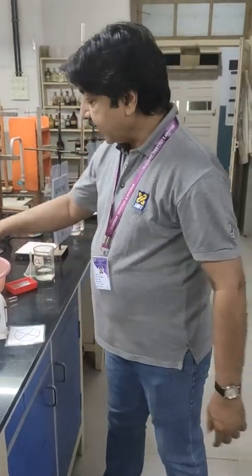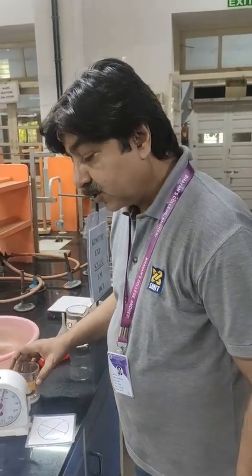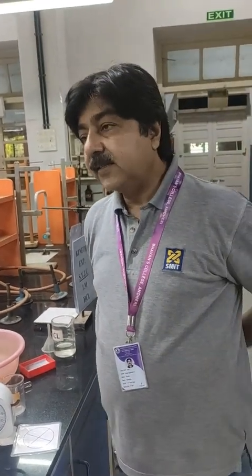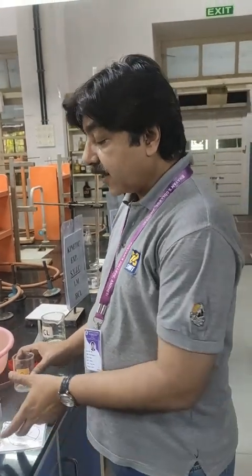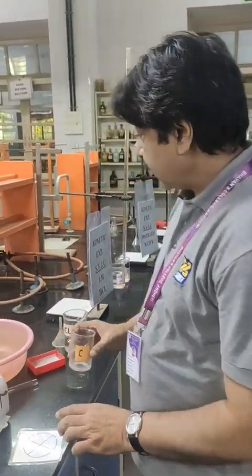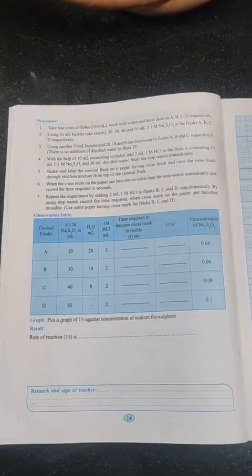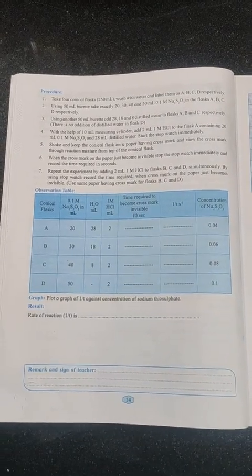Now in the same fashion we will proceed with the next part, that is part C. So for part C, now we are taking 40 ml of sodium thiosulfate and we are adding still less water, that is 8 ml, and then we will be adding 2 ml of 1 molar HCl, and once again we will record the time for this third reading. So I am taking the third reading by taking 40 ml of sodium thiosulfate solution.